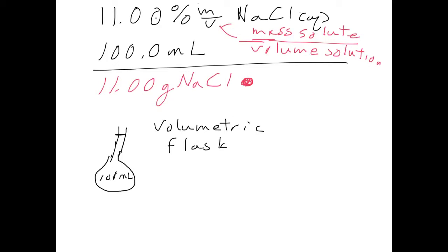It's made to hold 100 milliliters of solution. The first thing I would do is place my solute, my sodium chloride, into that volumetric flask.